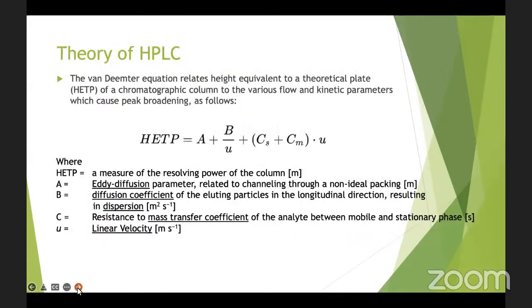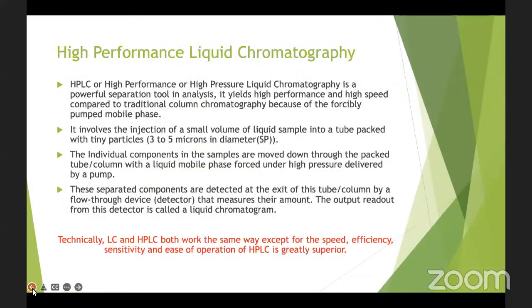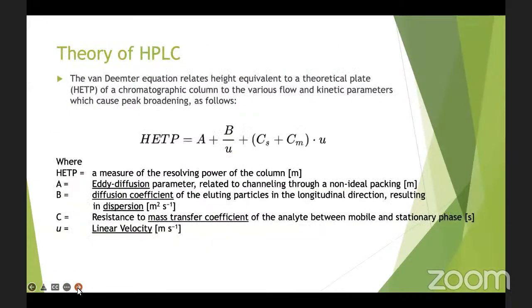Before we talk about the theory of HPLC, let's see what are the components of HPLC. The stationary phase is the component that is filled in the column. I'll discuss this later in a more framed way. We'll first talk about the theory of HPLC.